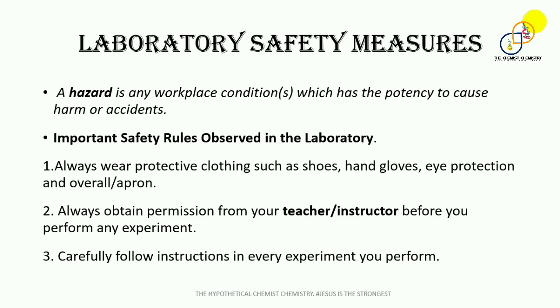As a matter of fact, most of the chemicals in the laboratory are harmful, toxic, and most of them are also flammable. As a result, the attention of the chemist must be drawn to all these things, and rules for his or her safety must be made clear in order to prevent him or her from these dangers in the laboratory.